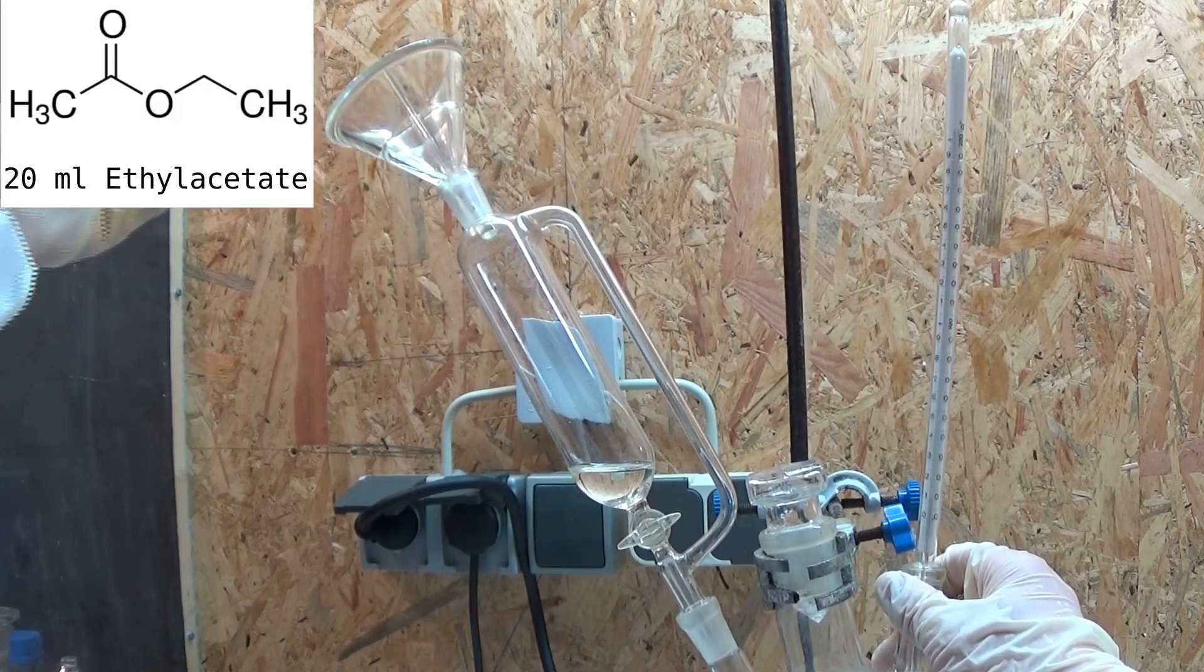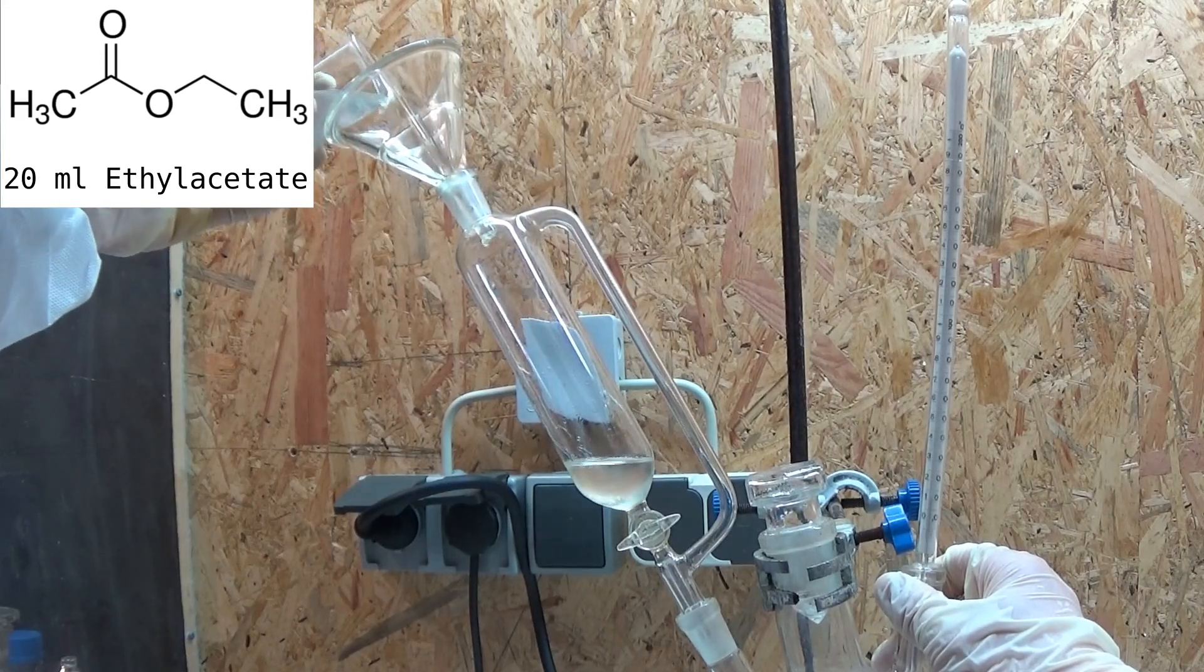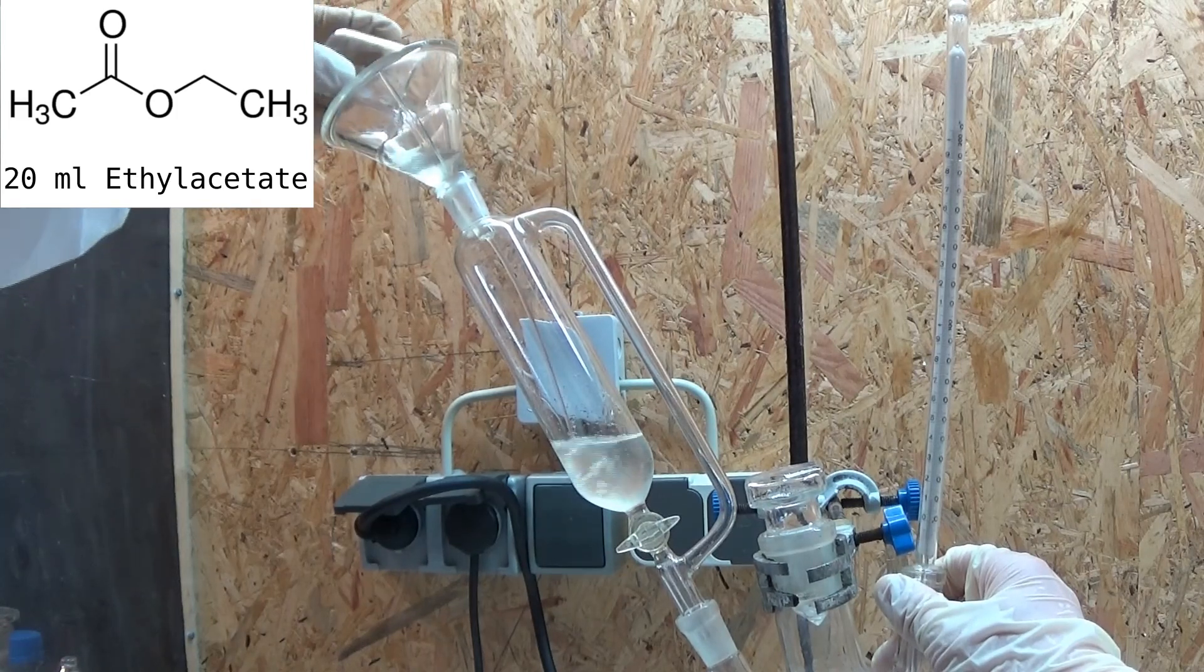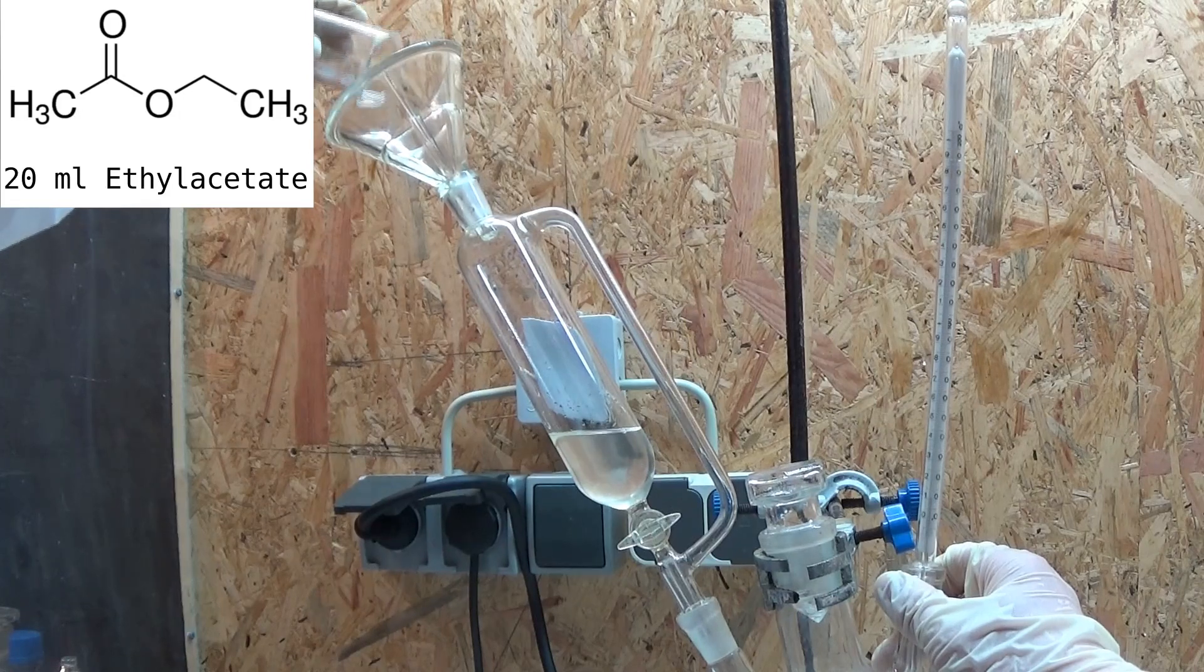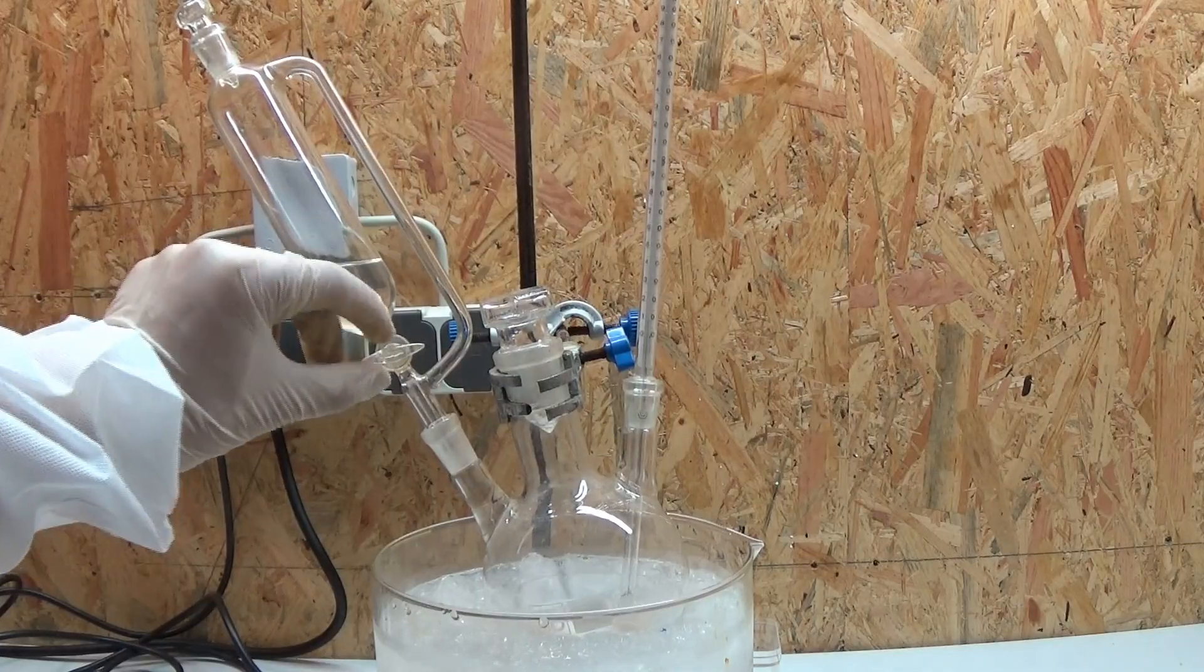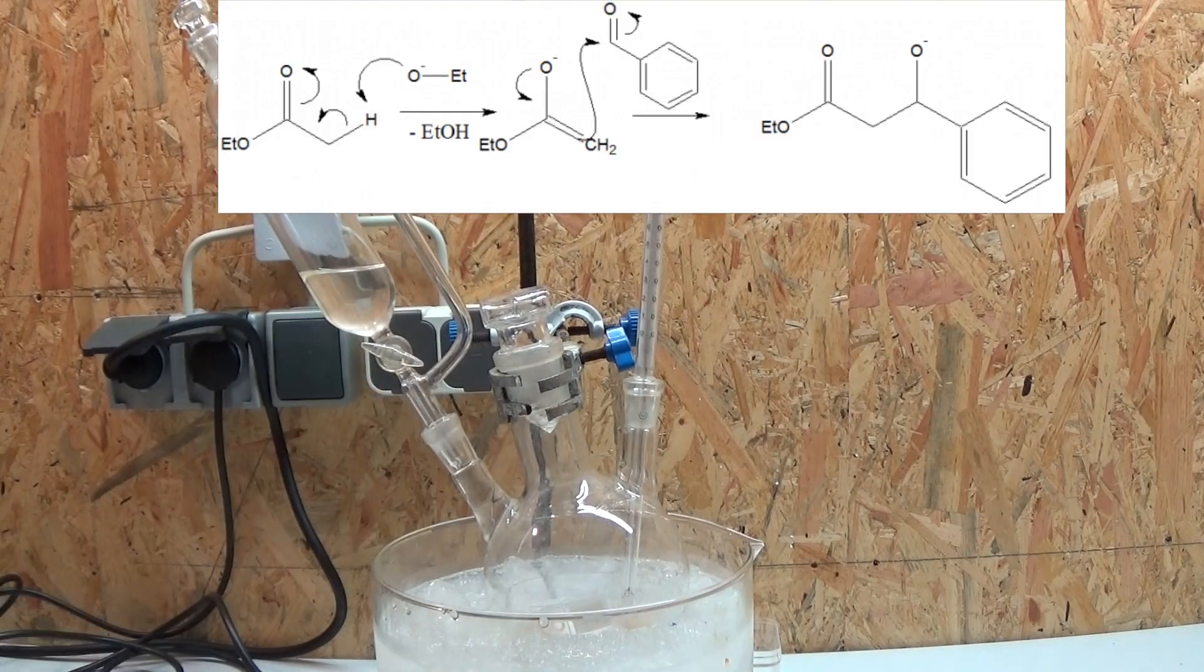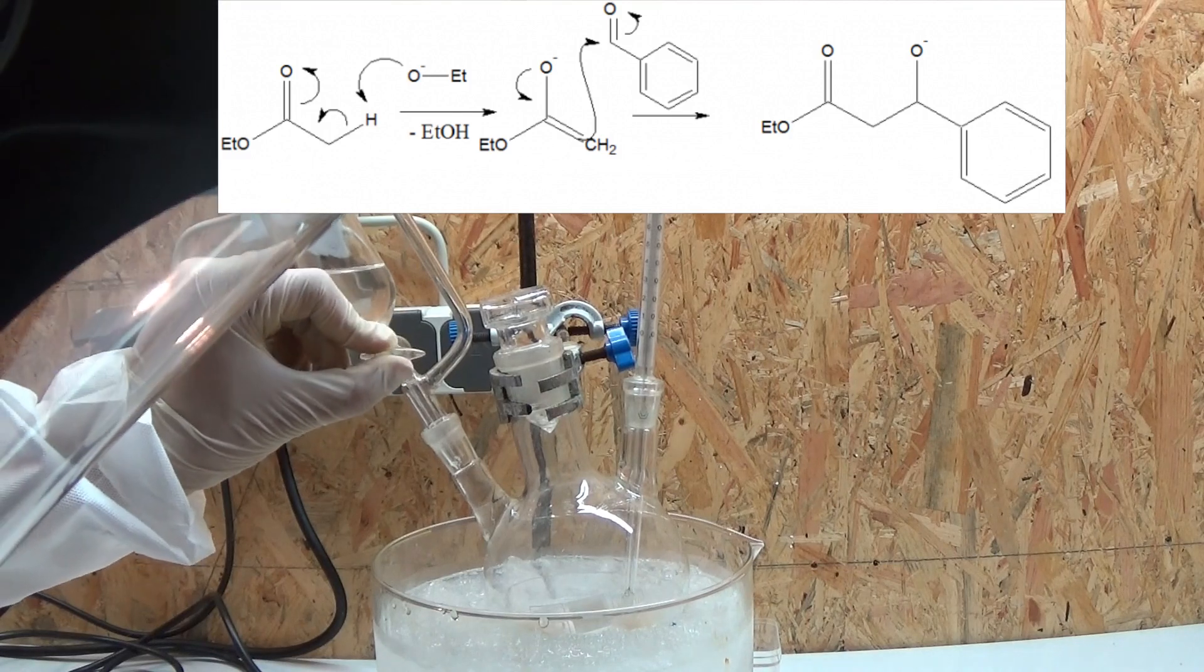To the benzaldehyde we add another 20 milliliters of ethyl acetate to reduce the concentration of the benzaldehyde we are adding, thus decreasing the heat produced by every drop we add to the reaction mixture which grants us a better temperature control. Now we slowly add the benzaldehyde ethyl acetate solution to the reaction mixture in a way that the temperature remains under 5 degrees centigrade.